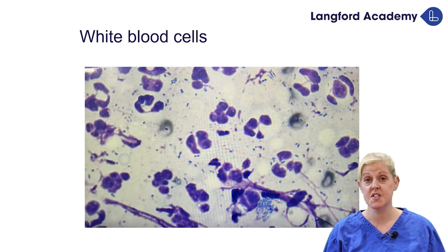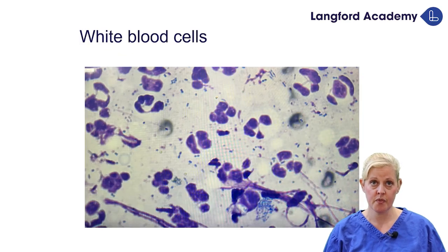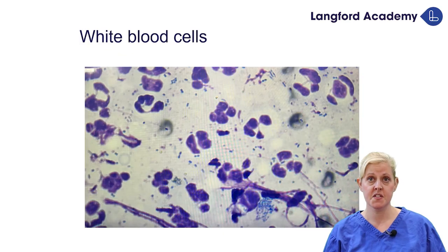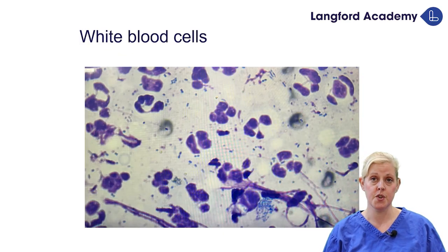It's not uncommon actually to see rods and white blood cells go hand in hand. You also might find that you get nuclear streaming, so that's those strips just going by. It's worth mentioning that to the vet if you do see them. In cats, it's quite common if we do skin cytology that we find eosinophils, but then that's their body's defense to these things. So don't be too alarmed if you're seeing, particularly on cats.